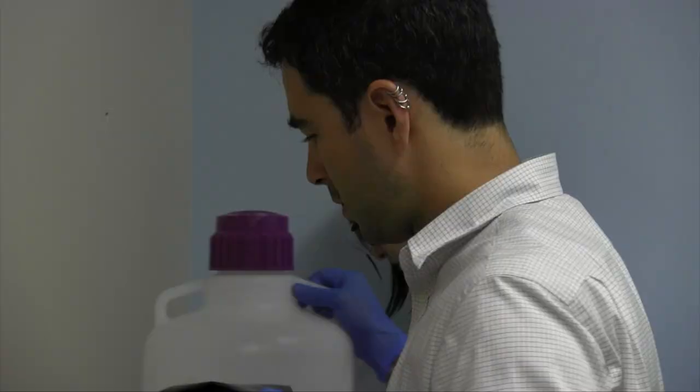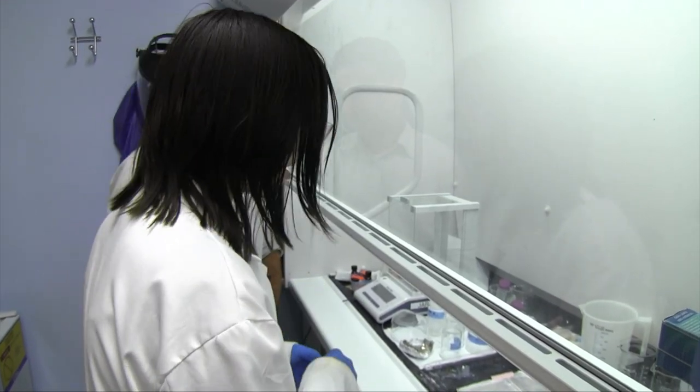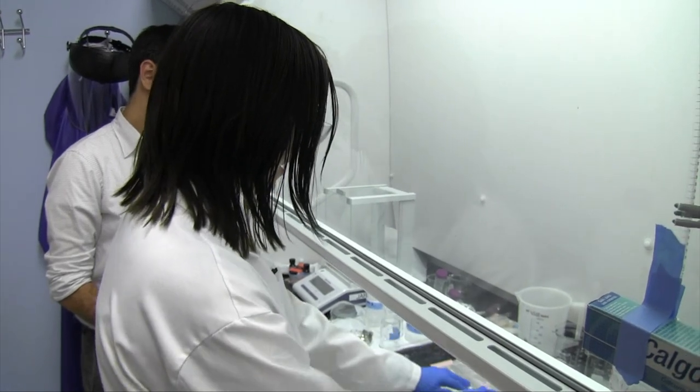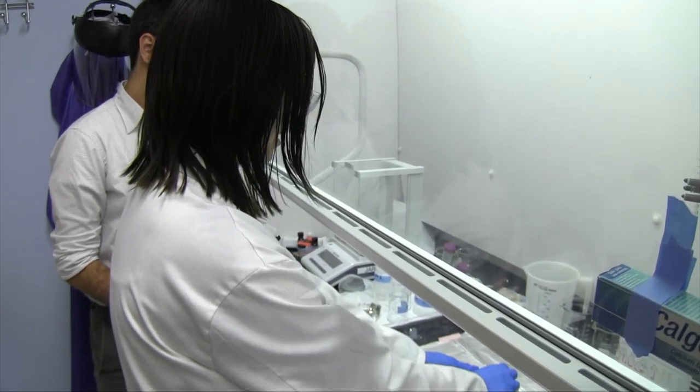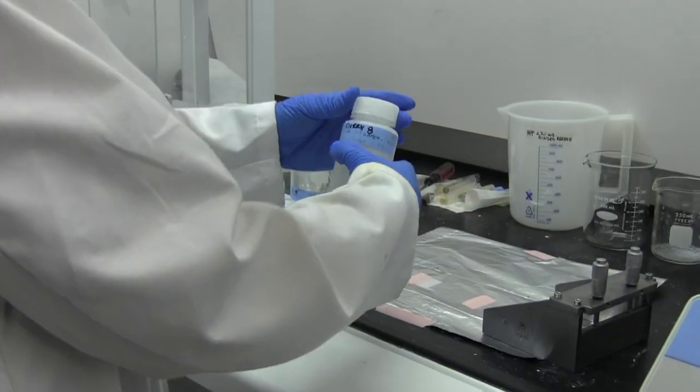We're tape casting thick films of zinc sulfide, which is a material that's very useful for infrared optics. I think it's never been done before because there hasn't been the technological driver, and also some of the sulfide processing equipment that we have here in our lab is very uncommon, and some of it we're developing here for the first time.